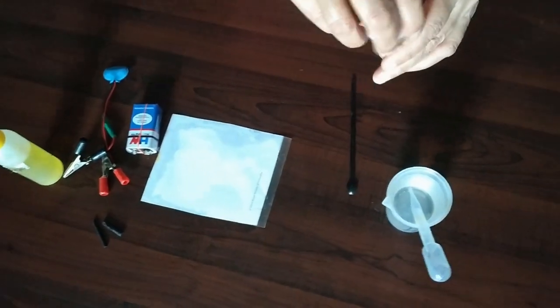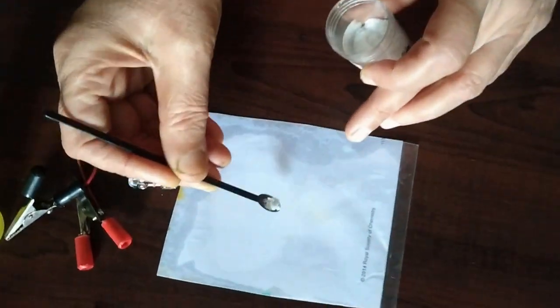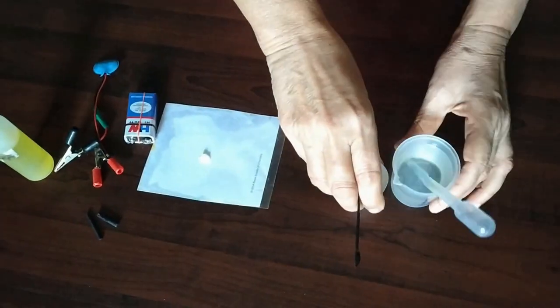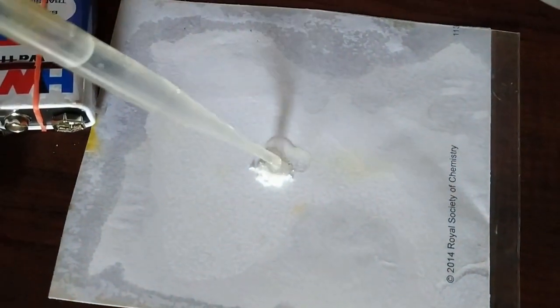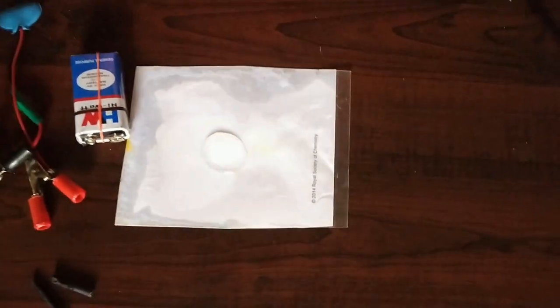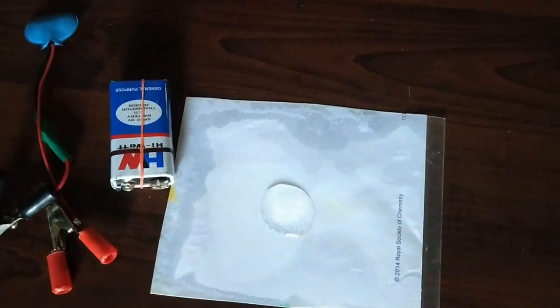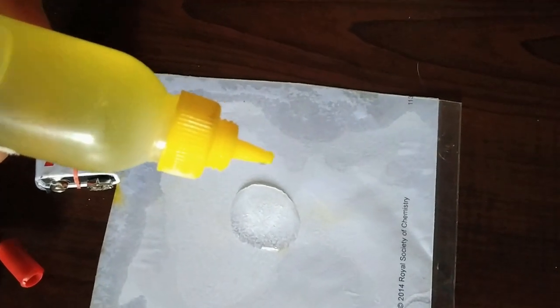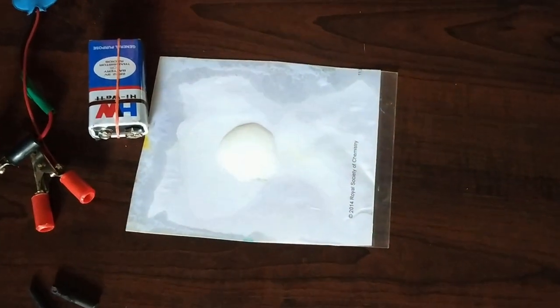To begin with, we shall add a little of common salt, that is sodium chloride, on this laminated sheet of paper. Then add some water so that it dissolves. Yes, so much is enough. Then add a drop of indicator that you have taken. So if you are telling the students to do it, you can tell them to take turmeric as an indicator. The powder itself they can add. Even there also the yellow color will turn red.